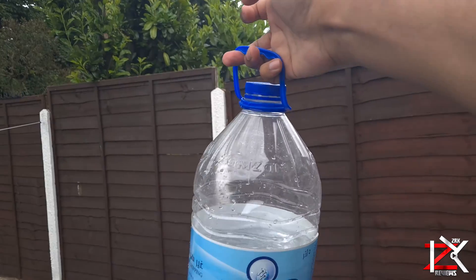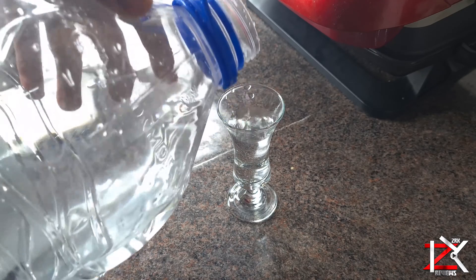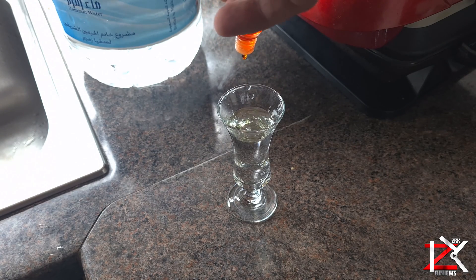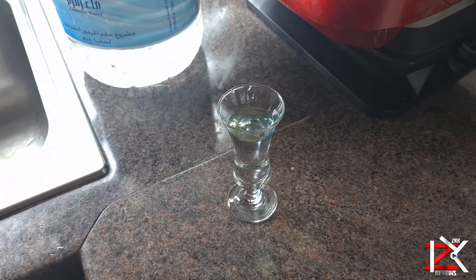Now I thought I'll carry out a quick pH level test on this water. So I'll add 50ml of Zamzam water, add 3 drops of pH level testing liquid, and give it a slight stir.